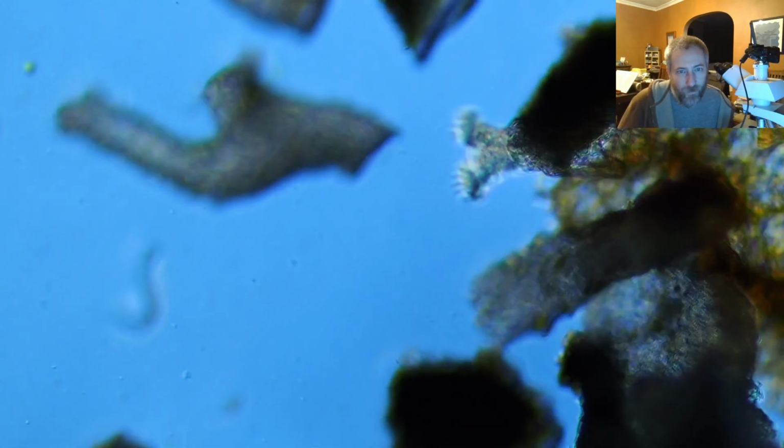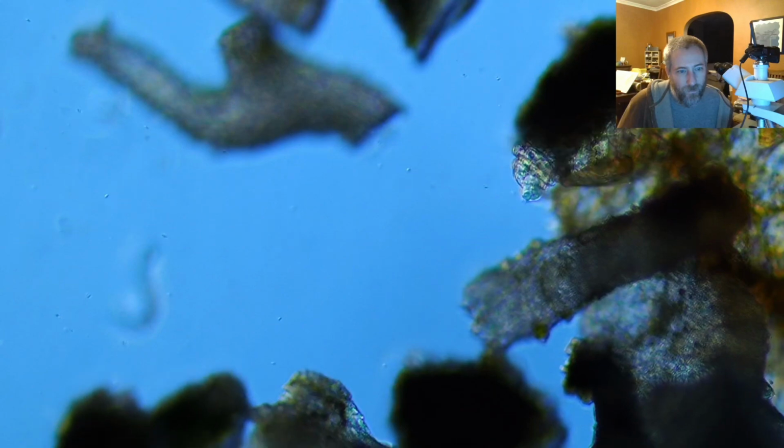And then you can see it's got a little chompy thing in its throat. That's the part that leads to its stomach. There you can see when it stretches its neck forward, there's a part inside that's moving around. Right there, the mastax. And you can see how it can pull its whole mouth part system inside its head and pop them back out whenever it needs to.